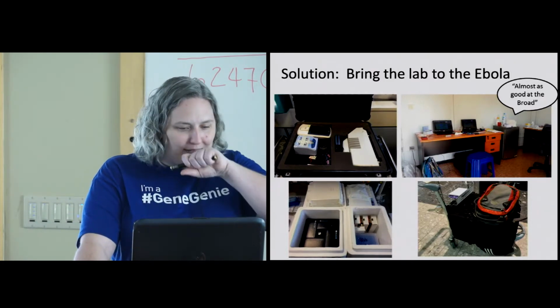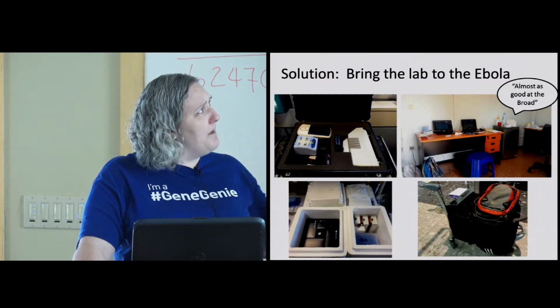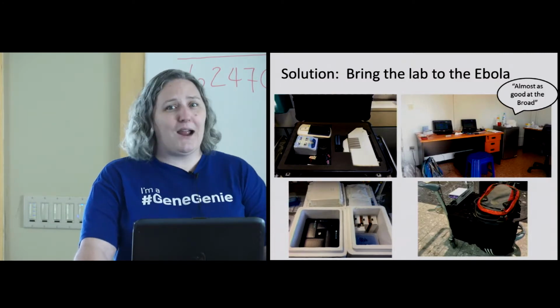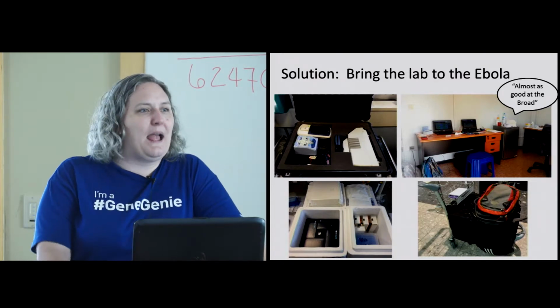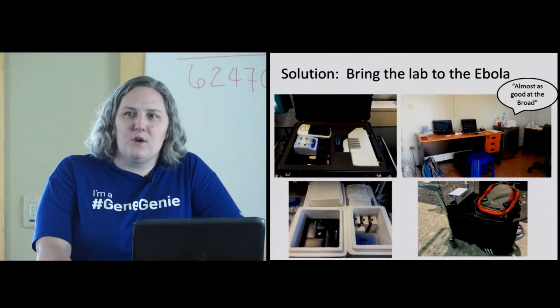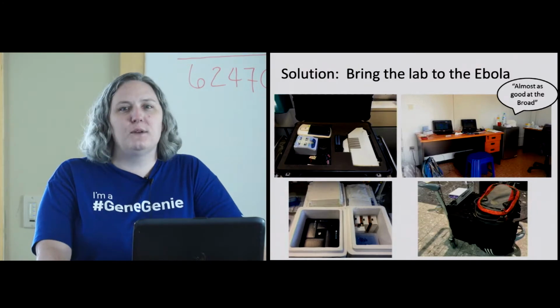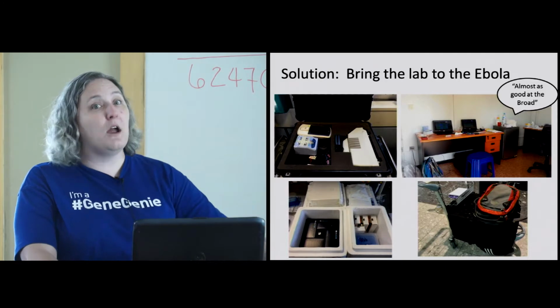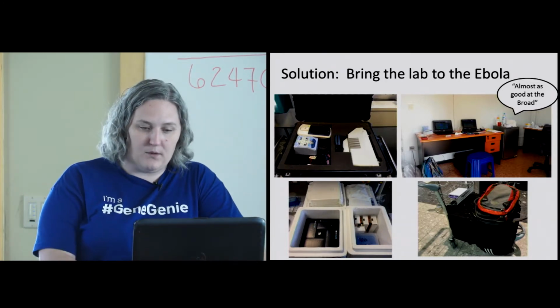What they did was pack up thermocyclers, Qubits, different measurements for monitoring DNA, and all of their reagents in a box, and they were able to carry it with them onto the airplane in a bag. So that's pretty significant. You can't really pack up a HiSeq, maybe a MiSeq, and carry it with you. But the size of this instrument really allows you to bring it into locations that you can't necessarily bring full-fledged sequencing into. And the researchers in this group actually ended up leaving all this stuff there, available for the researchers in the location to continue this work on monitoring the Ebola outbreak.